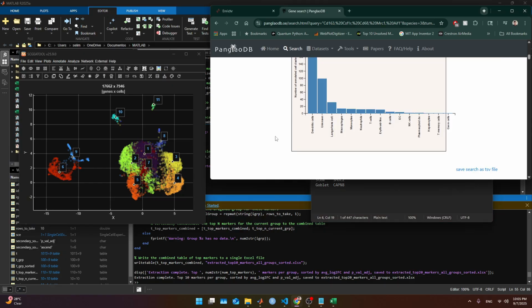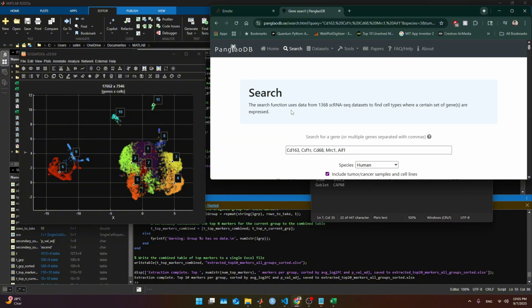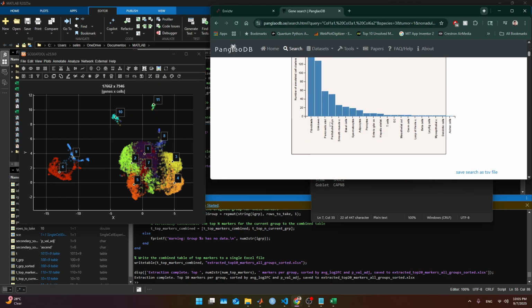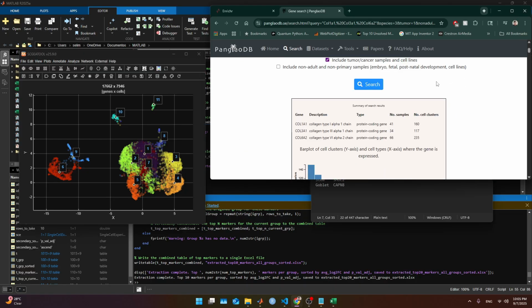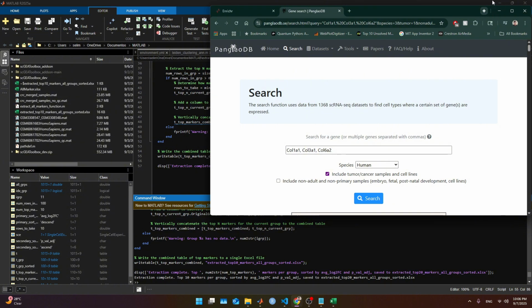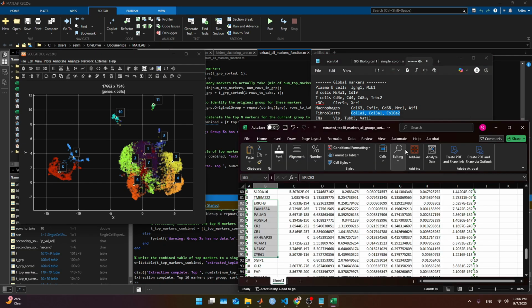Still fine. We can, for example, now look at this set for fibroblasts. Look for it. And fibroblast. So it's definitely a fibroblast marker set. And this is for verifying what we see in the differential expression. So what seems to be happening in this sample is that it needs to be decontaminated, and that's gonna be for a different lecture.